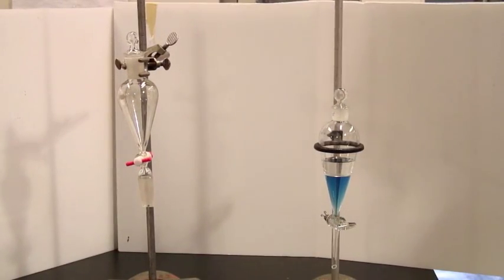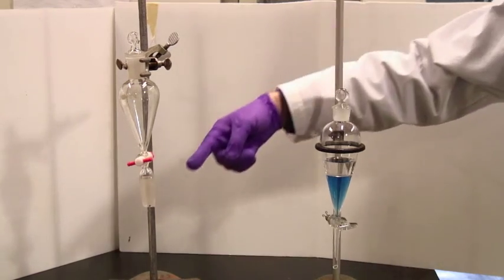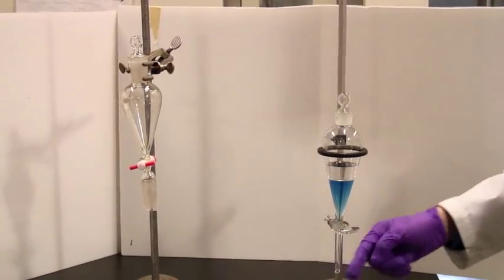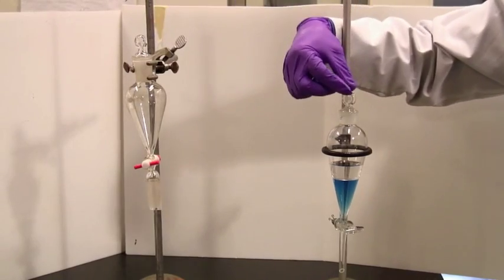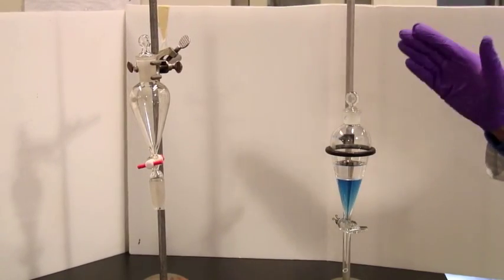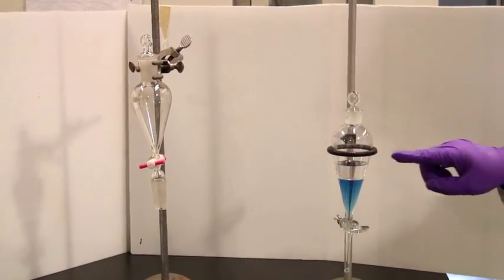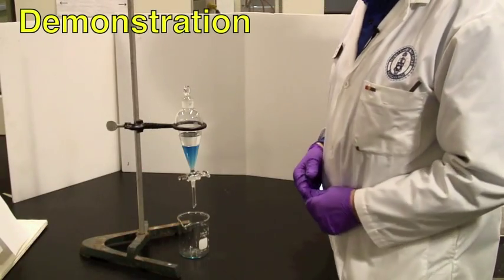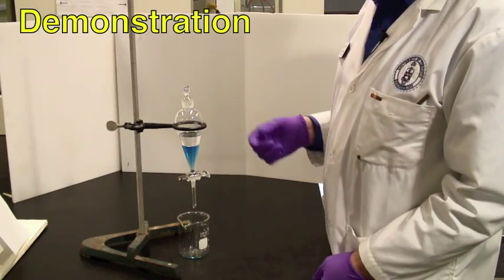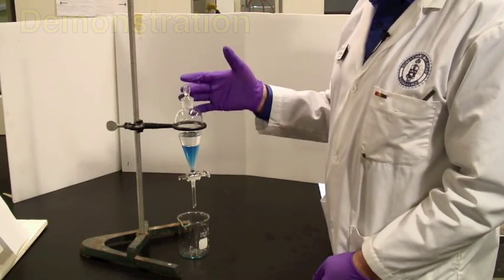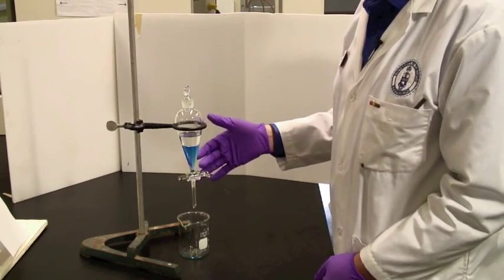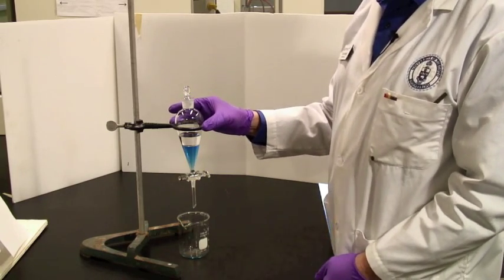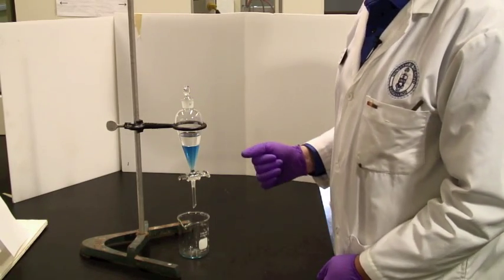There are two different kinds of separatory funnel. This one has a different nozzle and they've also got slightly different caps. They are completely equivalent. You can also hold them in two different kinds of clamp. Separatory funnels are usually pear-shaped and the ones that we have in the lab have two different kinds of spout, as you've seen, and they can either sit in a ring clamp or a three-finger clamp.